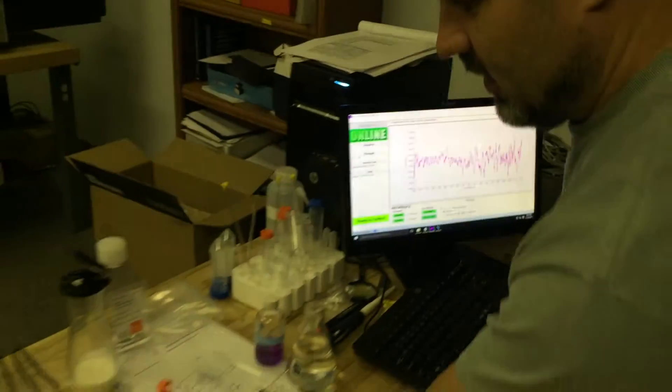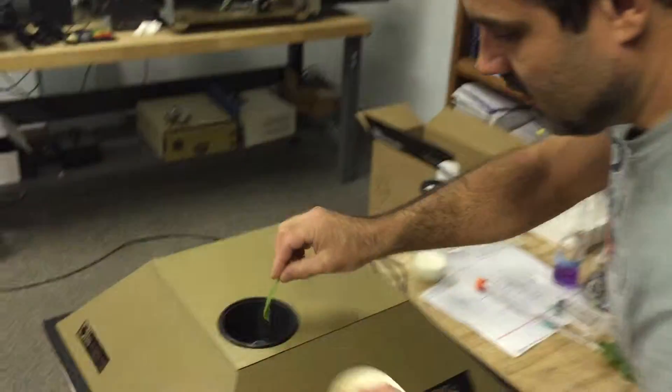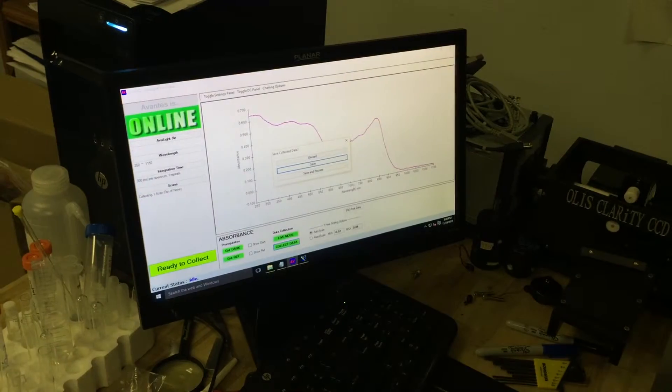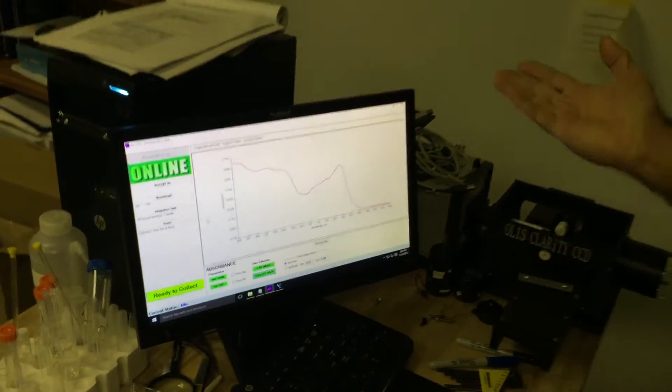With very low absorbance. Now, some plants from the backyard — I stick the green leaf inside, taking the measurements, and voila! This is the absorbance spectrum of chlorophyll.